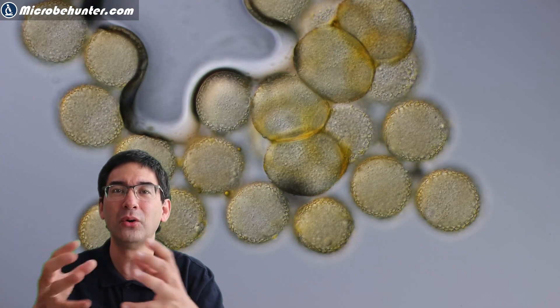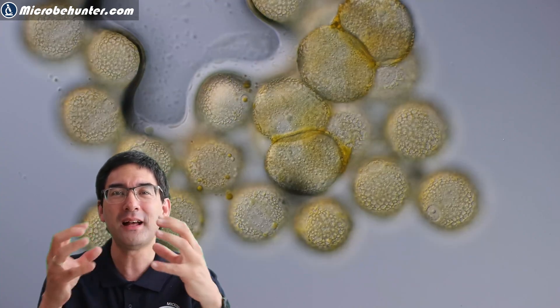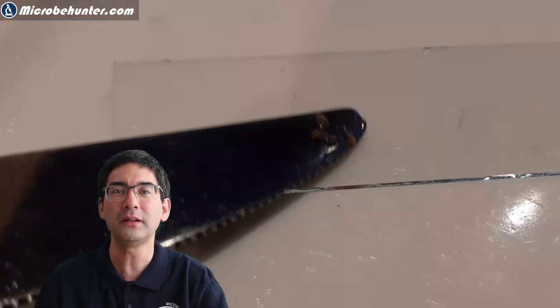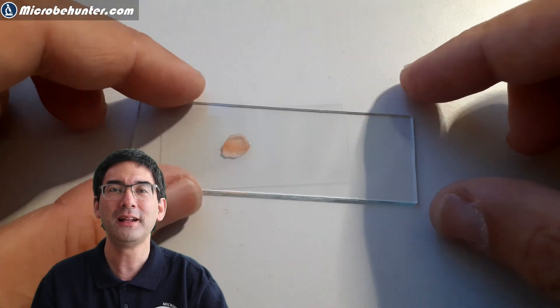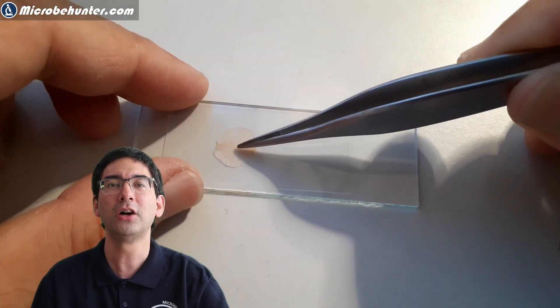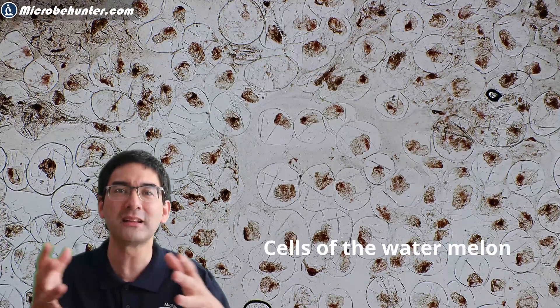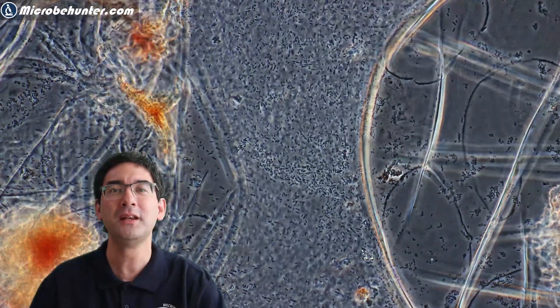Then the fruit starts to grow and a new watermelon appears. First they were quite small and tiny, but after a couple of weeks they really started to grow. This watermelon here is already a few days old. I took some of the soft pulp and put it directly under the microscope, and this is where I saw a lot of bacteria — not surprisingly, because the cut surface is exposed to air.